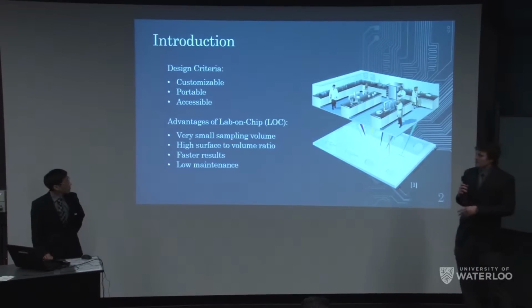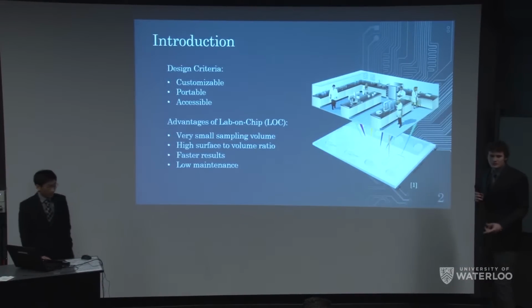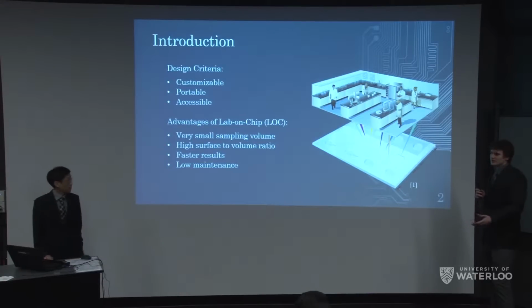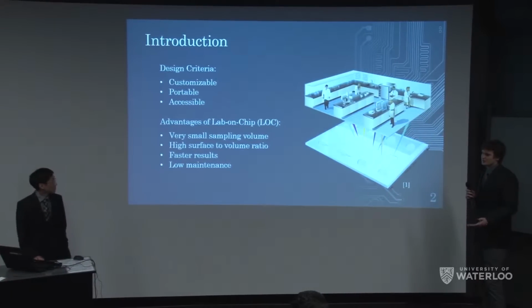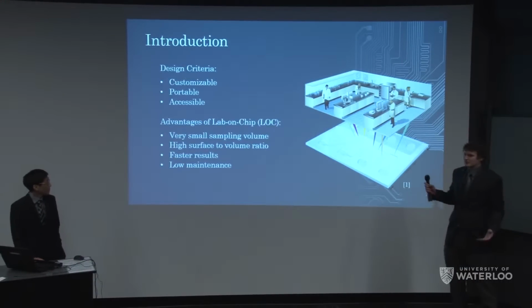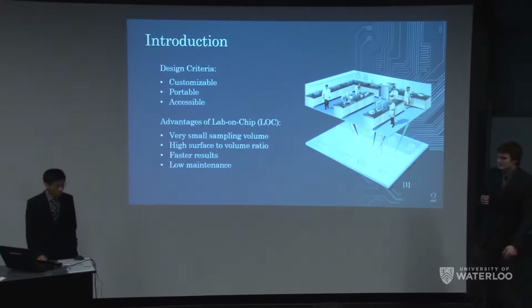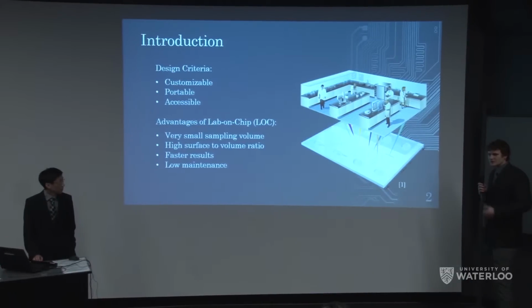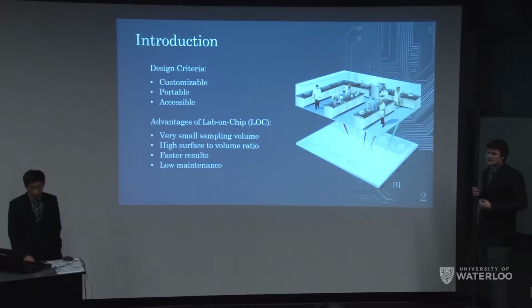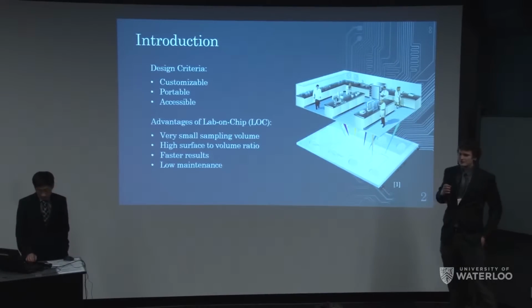So basically, stemming from that, we based our design criteria for the project on its customizability. We want the user to be able to approach it and customize it based on their microfluidic preferences and designs. We want to make this device portable. We're not trying to make a lab-sized desktop instrument. And also accessible. By accessible, I mean we want to use materials and equipment that is commonplace, that doesn't require a high upfront investment.